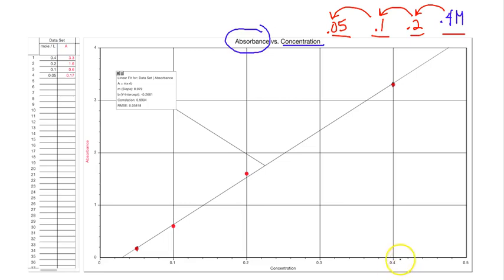So what we did is, notice at 0.4, we measured a certain absorbance. The spectrophotometer was connected to the computer, and we measured the absorbance, which is the negative log of the transmittance. That absorbance is due to the fact that the higher concentration had more particles of matter in it, absorbing certain wavelengths of light. In any case, we entered the value. So we did this for these 4 points.